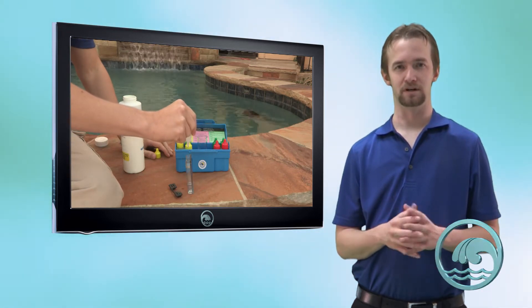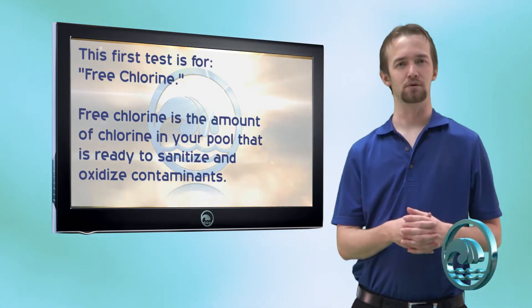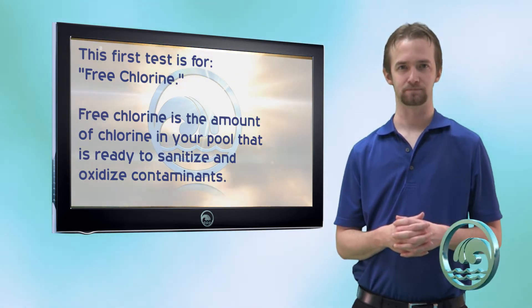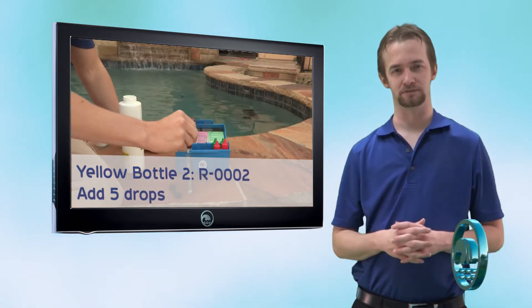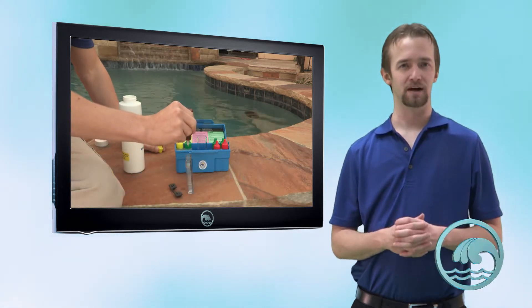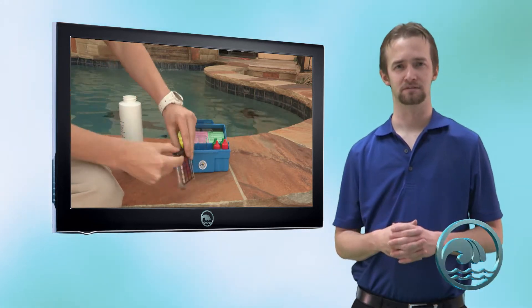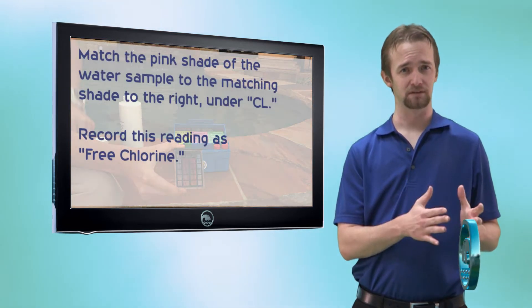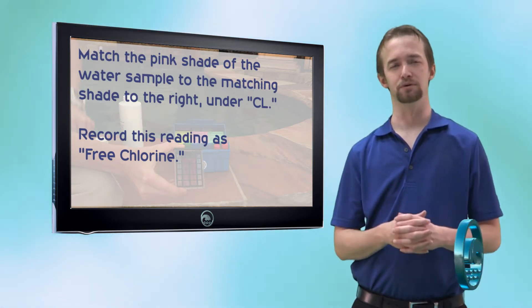Now the sample is ready to tell you a chlorine reading. The first thing we're going to test for is called free chlorine — the amount of chlorine in your water that is available to remove contaminants and sanitize microorganisms. Take R0002, invert the bottle, and add five more drops. Using the caps provided or just your thumb, cover the top of that compartment and give it a good shake. Hopefully the water will turn a shade of pink, which means you have free chlorine. Match the shade of pink to the shades listed on the right under the CL column — this will give you your free chlorine reading.